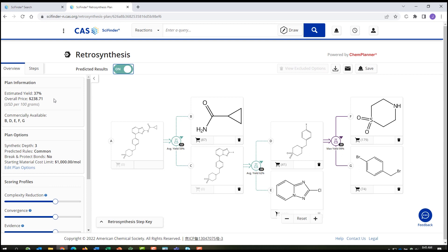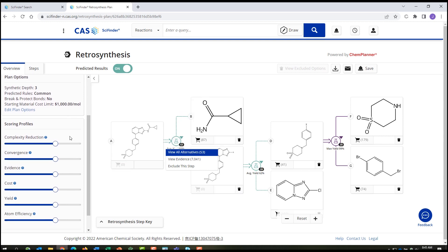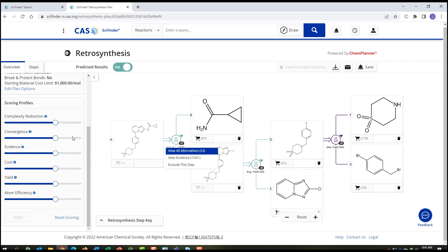Perhaps improving the price and the yield. For every step in the plan, you can see evidence for the suggested reaction, plus alternative reactions that you can review and evaluate. You can even change the weighting on major scoring factors, and apply your own experience to evaluate and modify the proposed plan to fill your research needs.